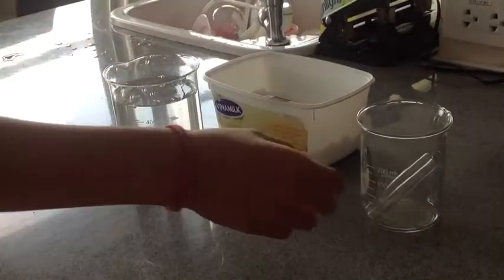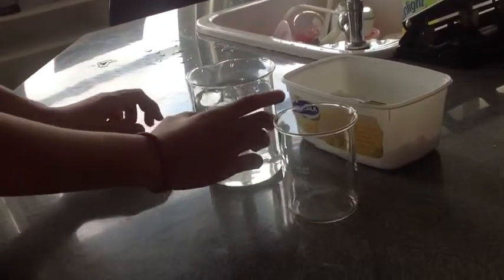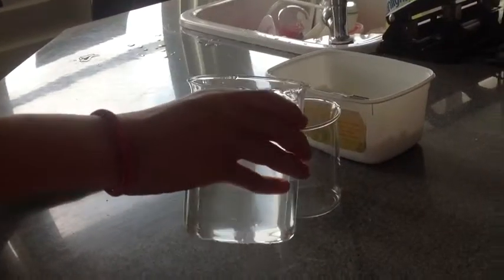Once the salt has dissolved, you pour around 80-90ml of salt water inside the small beaker.